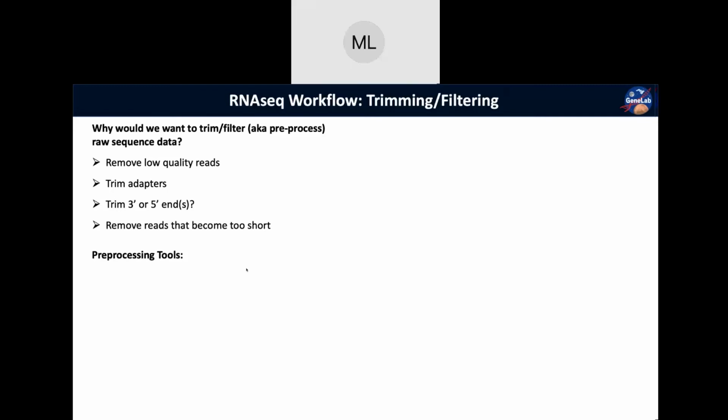No, I think you nailed it. When we're doing amplicon sequencing, we're targeting a specific sequence that's highly conserved, a specific fragment of usually the 16S gene. There's going to be a lot of duplicates because that's how it works. We're looking at one gene rather than trying to look at everything. When you have a singleton, something that only shows up once, it's likely to have an error in it, because it's very unlikely for an organism to be there with one copy of one sequence that's not represented by anything else in your data set. This is one of those areas where you expect entirely different things based on what you're doing.